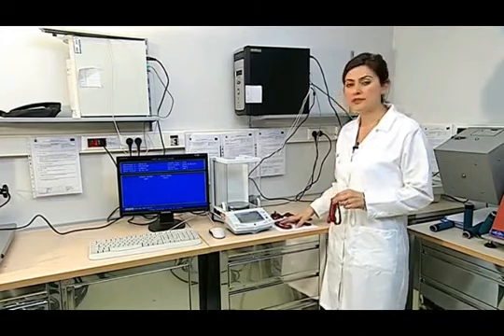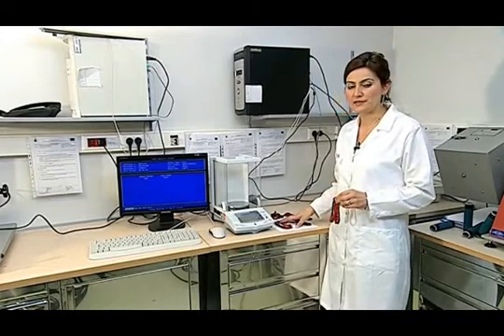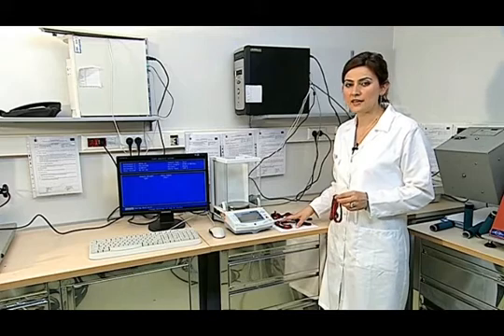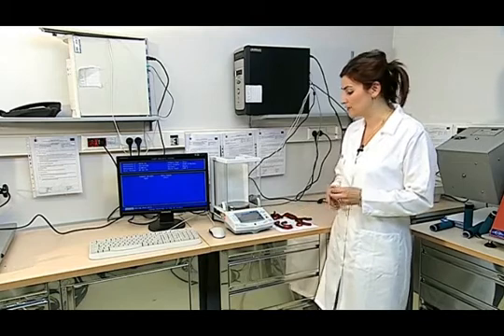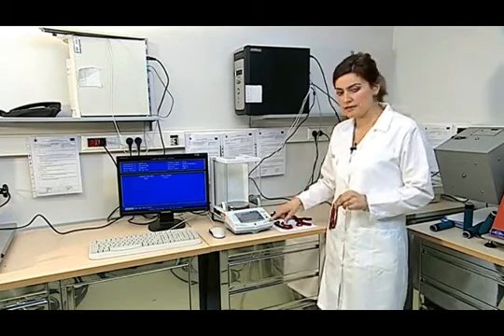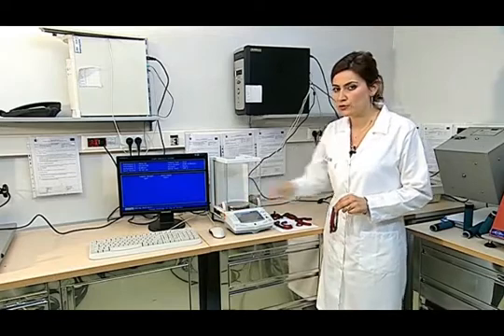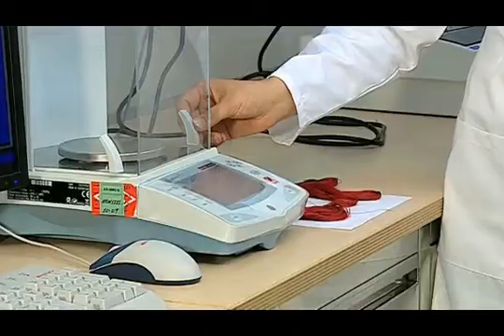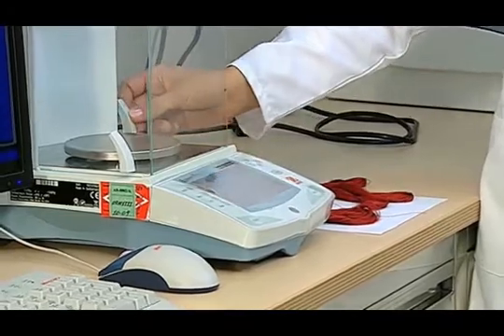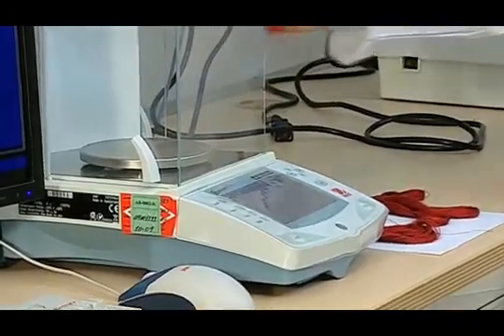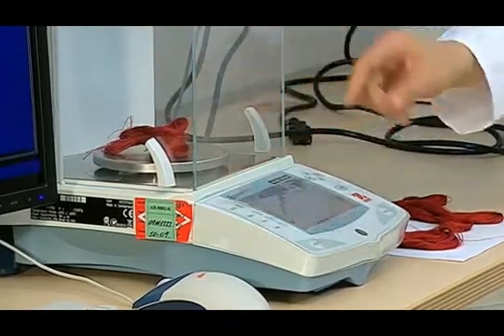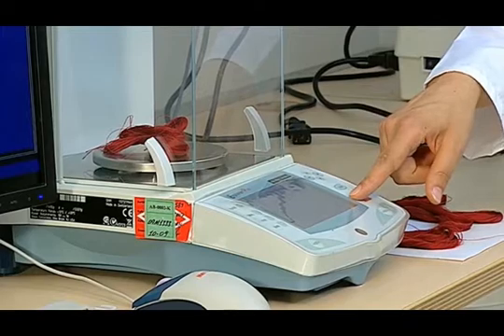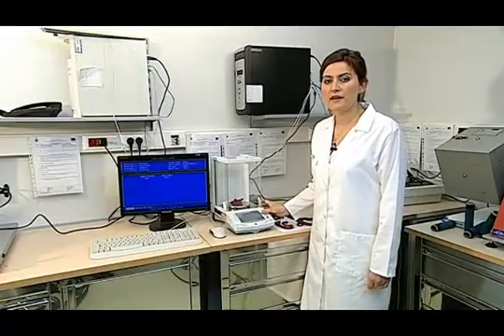Five samples of 100 meters long that are wound in the reels are conditioned in standard atmospheric conditions, or they are heated and dried in an oven at 105 degrees Celsius, and then weighed. In this test, we prefer conditioned samples. Our screen is reset and we ensure that all the flaps are closed. Our precise balance has the ability to measure the sample's mass with a precision of 1 to 100, and the mass of the sample is read in grams from the screen with a precision of 10 to the power of minus 3. Then this value is noted down.